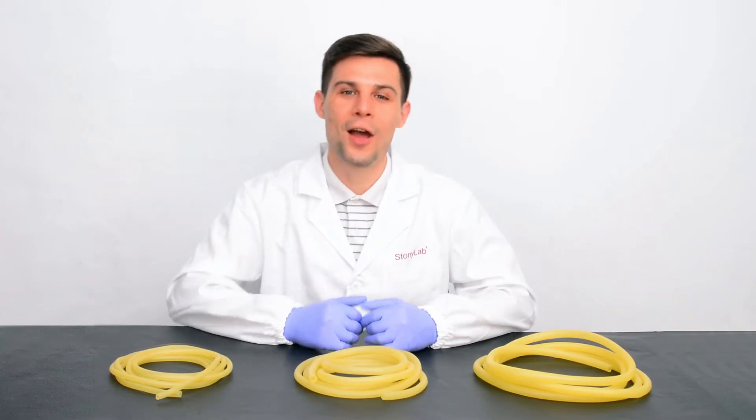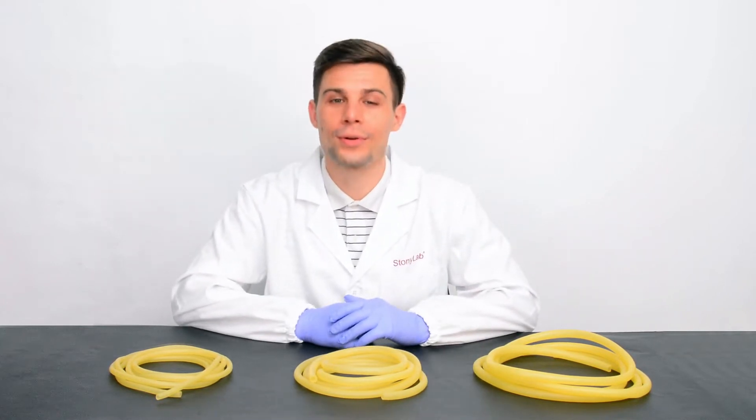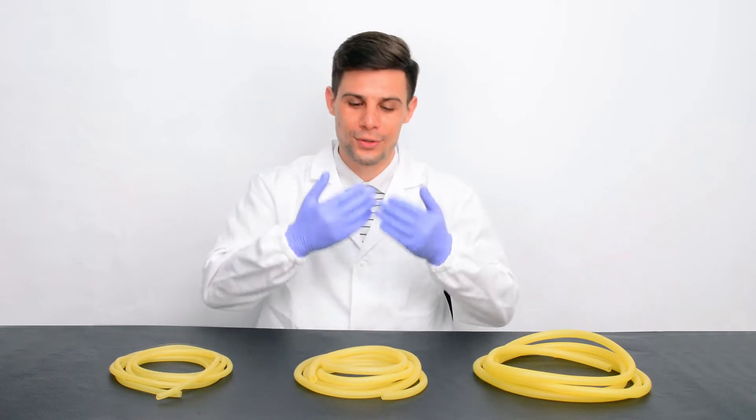Hello, everyone! Welcome to StonyLab! Today I'm going to introduce you to our product: rubber tubing.